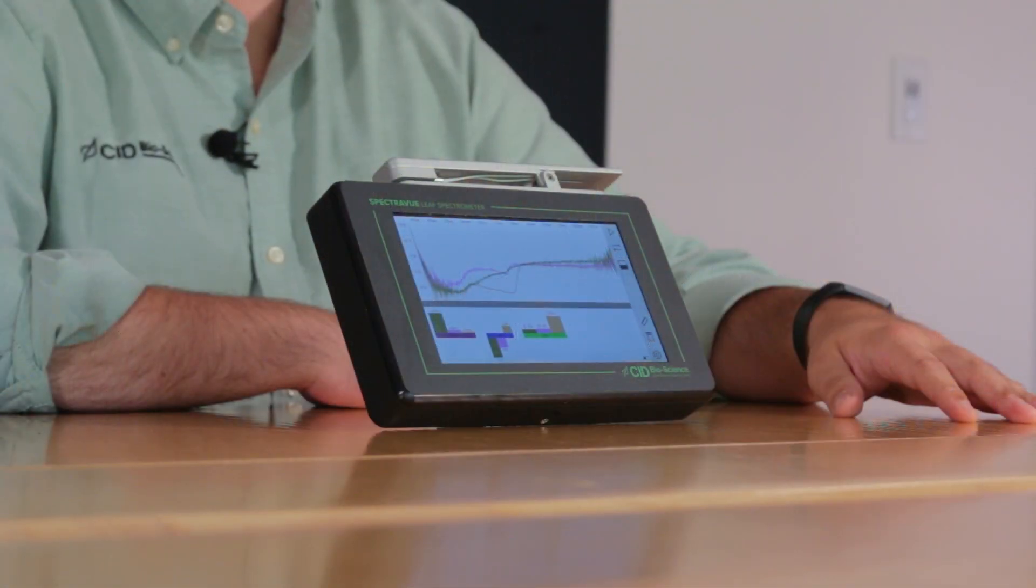Hi, my name is Galen George and I'm an application scientist here at CID Bioscience. Today I want to talk to you about our new CI710S SpectraView leaf spectrometer.